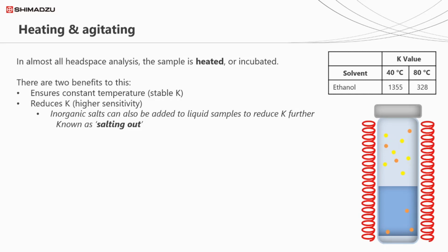Also consider that adding salt will reduce the headspace volume, altering the phase ratio. So it's essential the same mass of salt is added to each sample to ensure consistency.